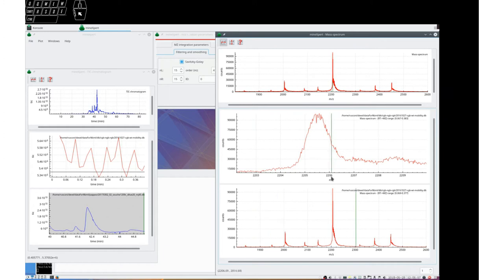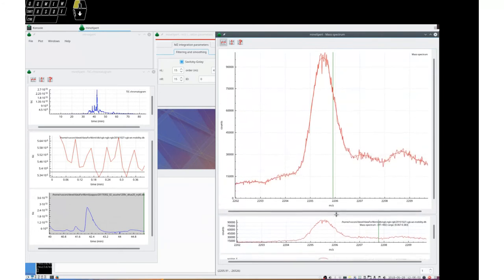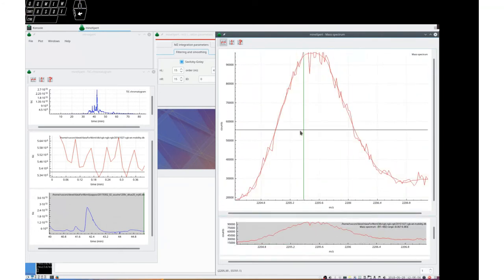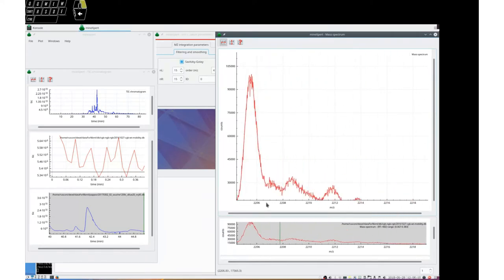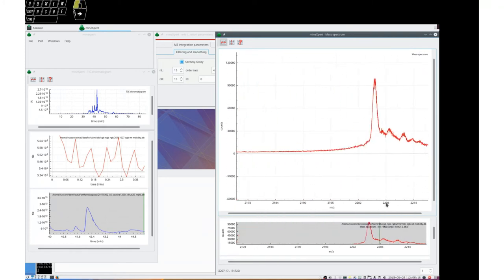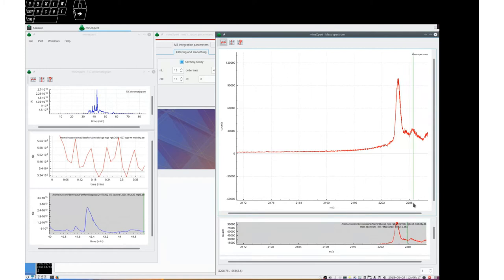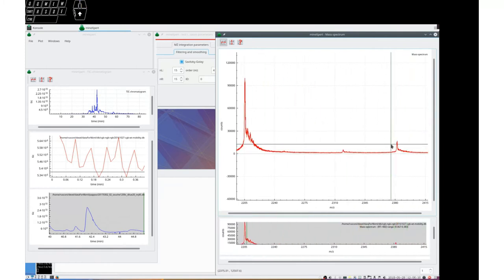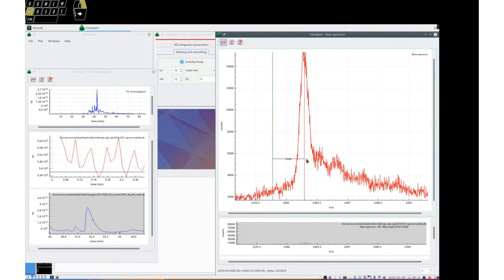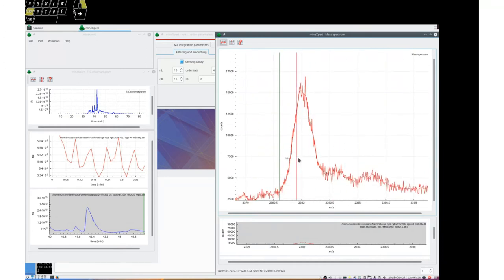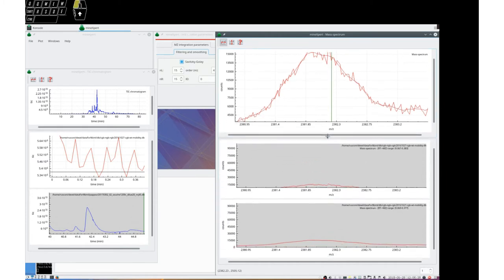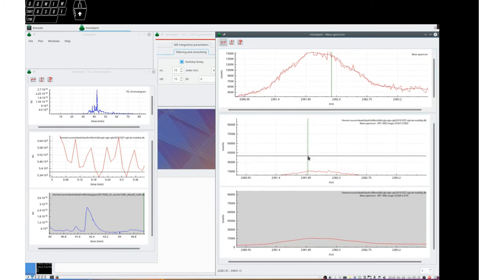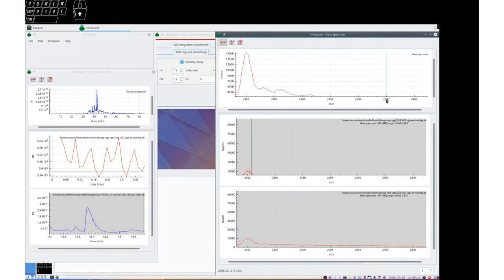Let's look at it. And you see that it matches perfectly the trace, so provides a very nice representation of the mass spectrometric data, exactly as you would expect for a filtered mass spectrum trace. There we are. If we hide the bumpy with the H key, we see the trace, and it's perfect.